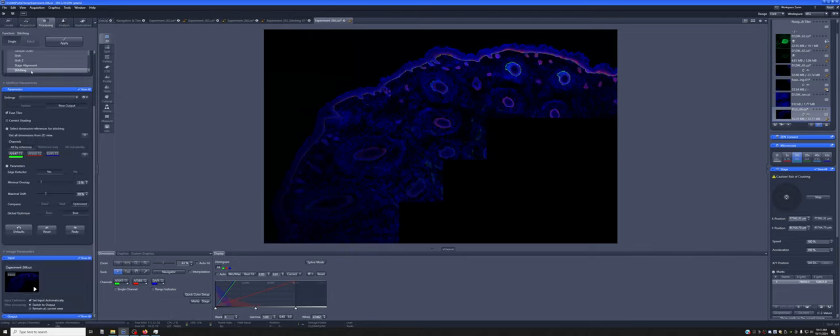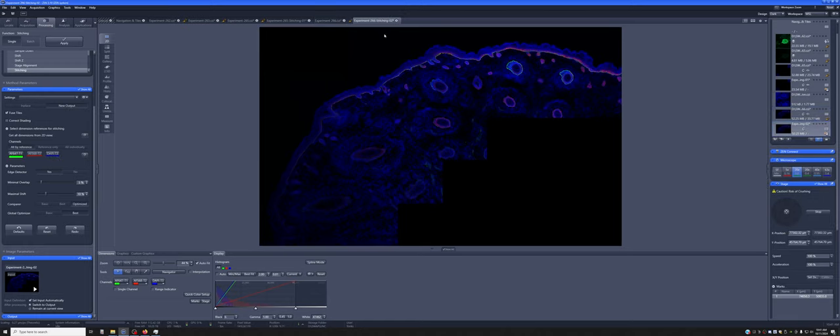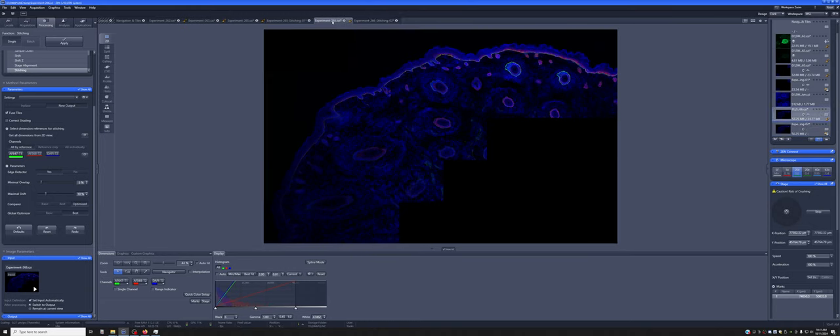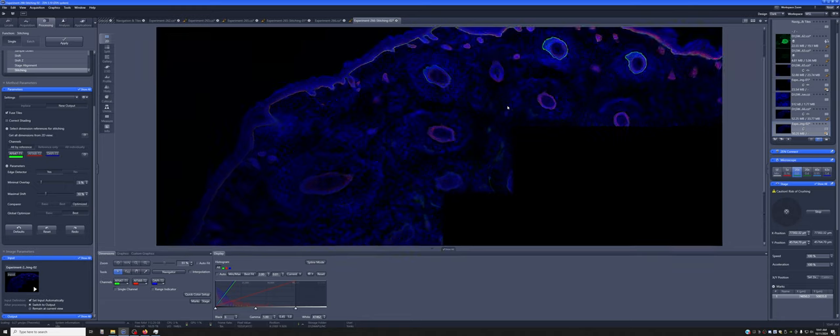We want stitching, new output, fused tiles. We want to use the DAPI. If I apply it, it will stitch this together. And if you toggle between the unstitched and the stitched, you might be able to see slight things that the stitching fixed.